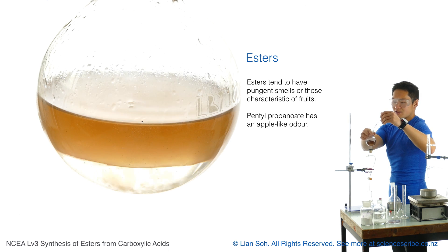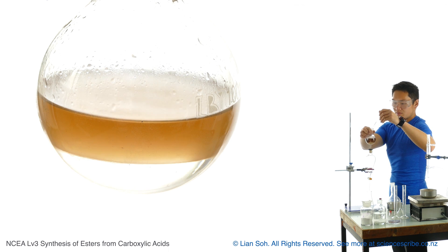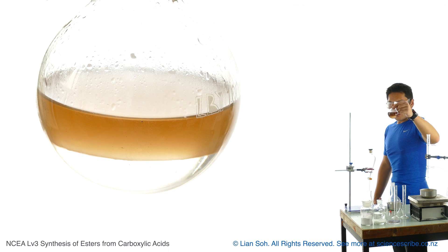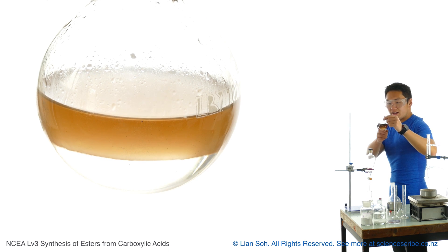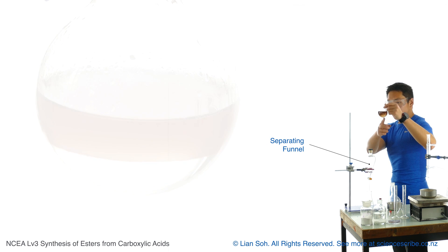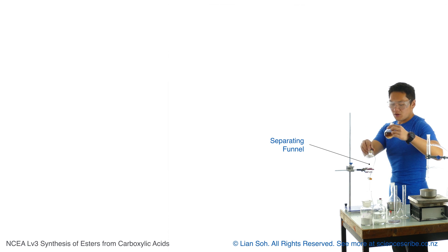I can already smell something coming out from the flask and it smells like a really intense mixture of apple and pineapple. My ester layer I expect to be on top, while my aqueous layer, which contains the water from my sodium carbonate, will be on the bottom. I also expect the propanoate ions to be in there as well, because those are polar — they're ions.